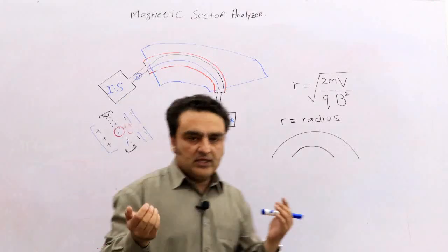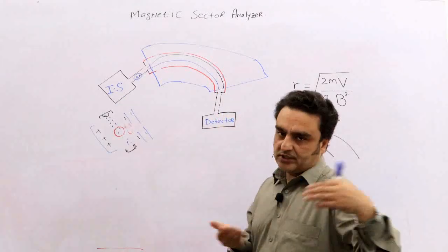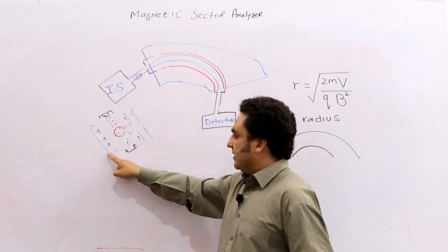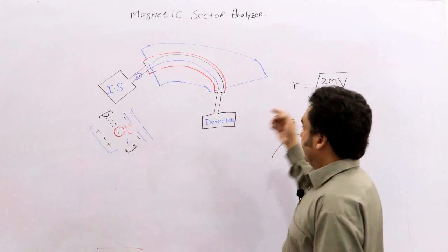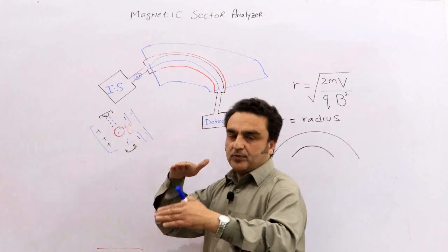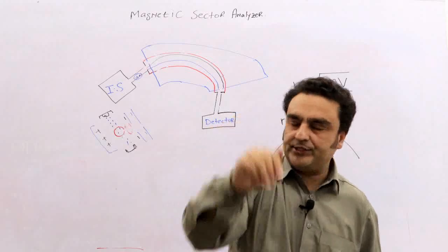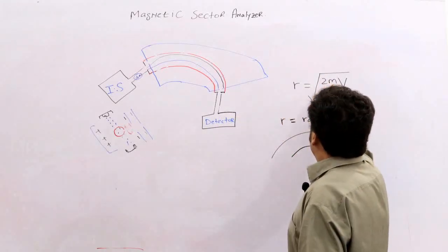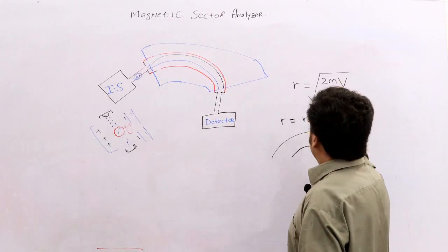So it is some volt. Maybe it is 60 or 6000 volt, or 2000 volt, or plus minus something. The pushing and pulling of the positive charge makes them accelerated, to move them faster. So this is the V.